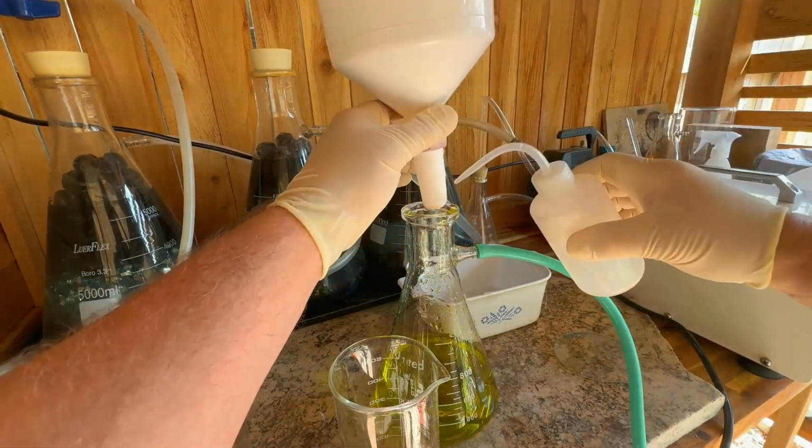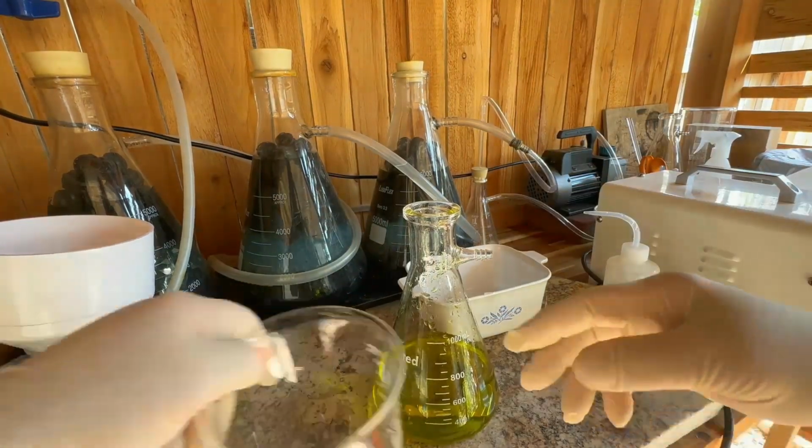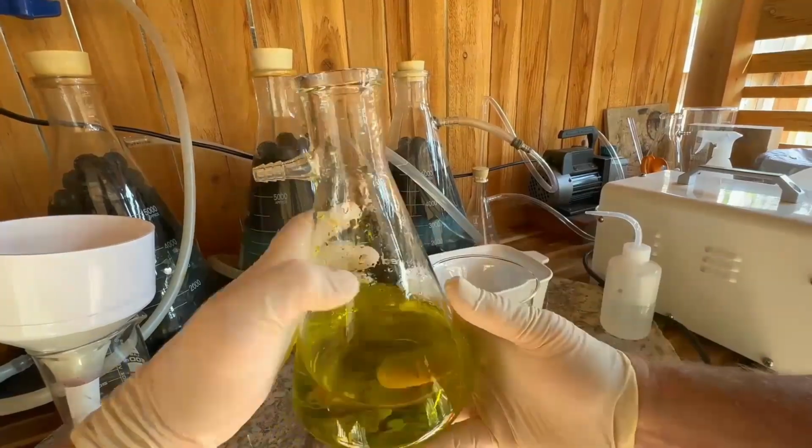All right, we're done with our second filtration. Clear that off. You can see not a lot of yellow left in there. We'll put that in our paper storage.